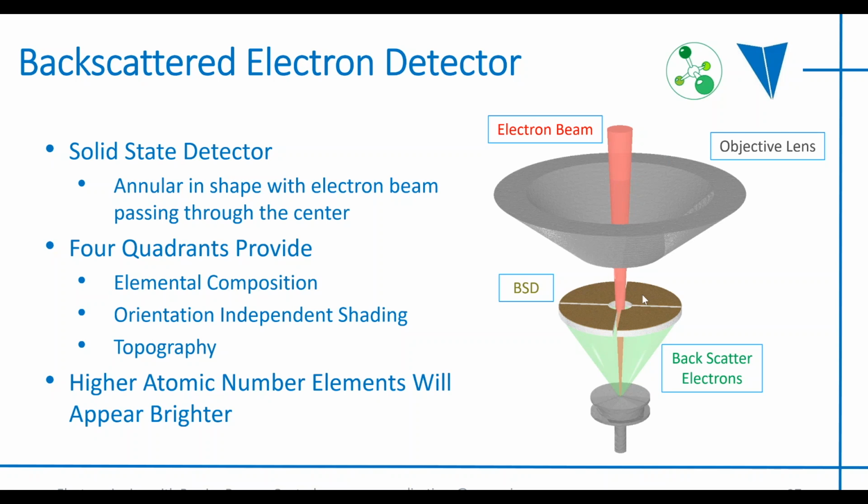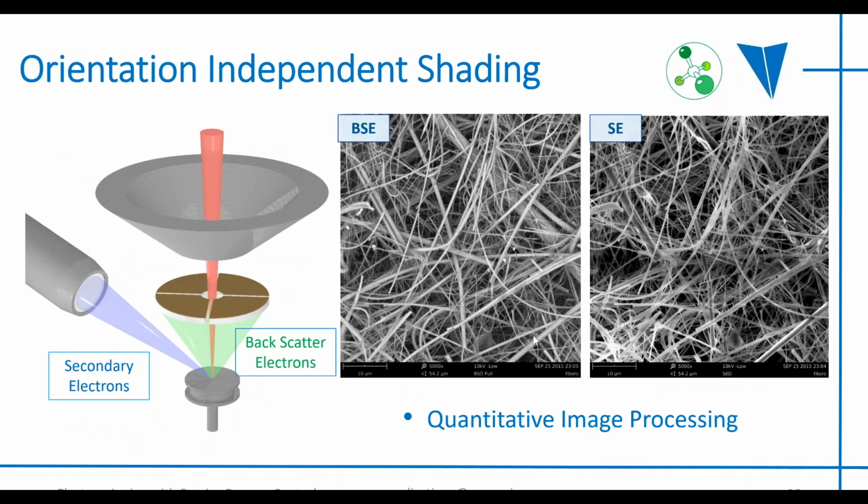The image is reconstructed on 4 separate quadrants, and the really big benefit to using this type of geometry is that the light source, those electrons, and the camera, basically the image is reconstructed as if those two things are coming from the same point. And so we don't see any shadows. In our SEM image, the shadows are basically cast backwards into the image as opposed to being at an angle or something like that. And that drastically improves the capacity to post-process these images.